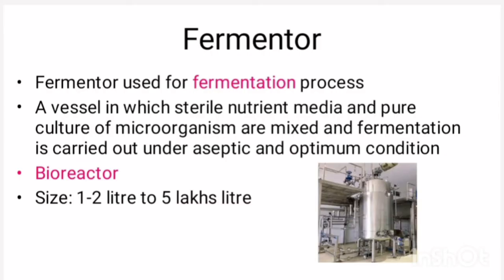What is meant by a fermenter? Fermenter is also called bioreactor. It is used for the fermentation process. Fermenter is a vessel in which sterile nutrient media and microbial culture are mixed and the fermentation is carried out under optimum condition.